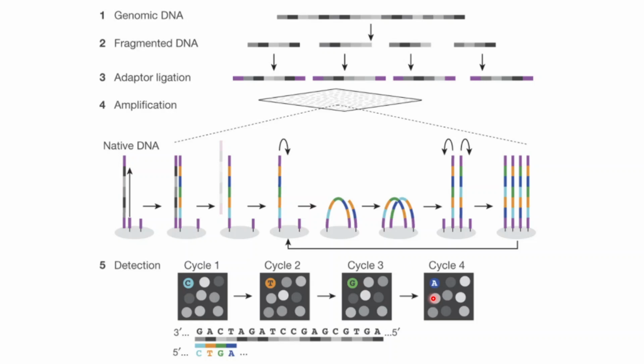So based on this, the sequencer actually consists of a high resolution camera. It captures each and every color that is popping up at different spaces in the flow cell. So they point out that at this point this deep blue is coming out. So it maps again at the same point what is the next color that pops up, and afterwards what is the next color at that point.